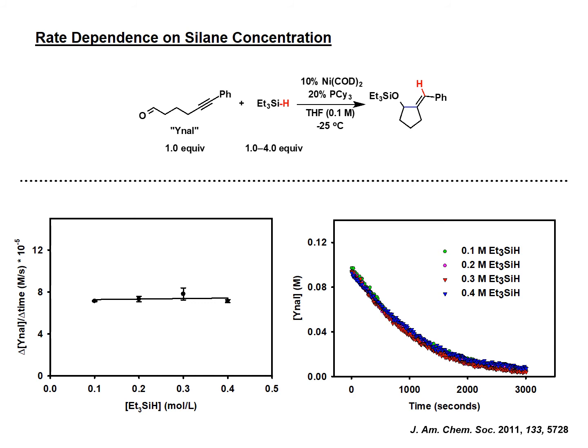You'd have to get pretty close to see that there's 4 different colors here, and that one of these represents a 4-fold excess of the silane. You can run this up to 50 equivalents of silane, and it's not going to change your rate. It doesn't move at all. So this fits with the metallocycle mechanism, a late incorporation of the silane into the metallocycle after some sort of rate determining step.